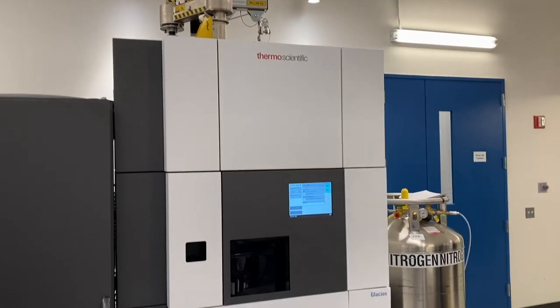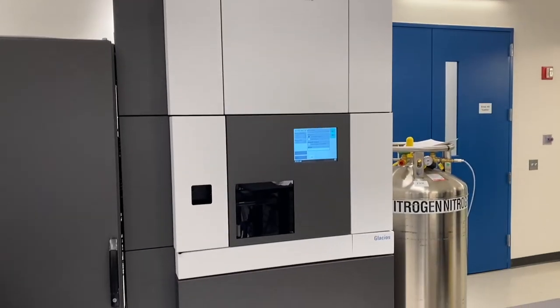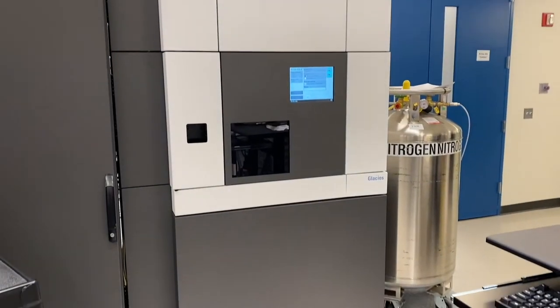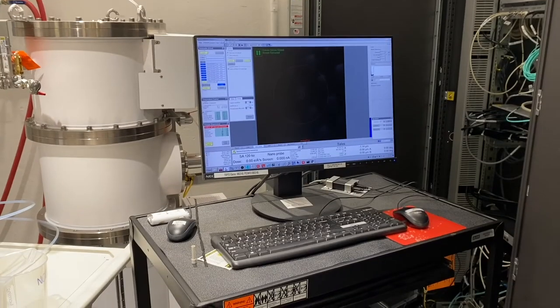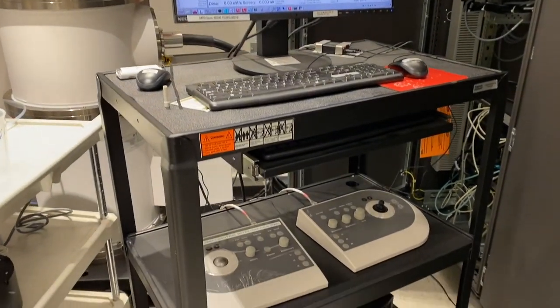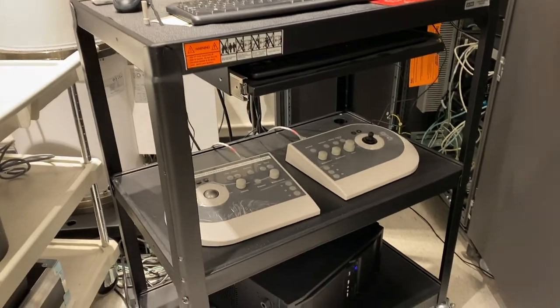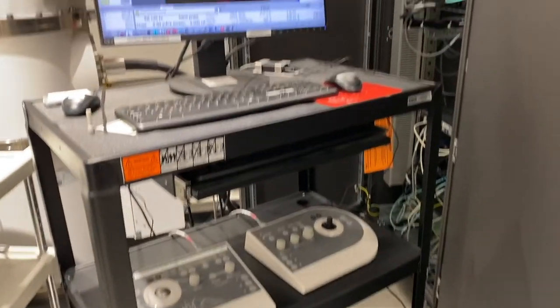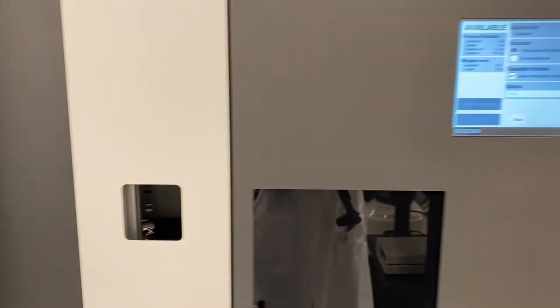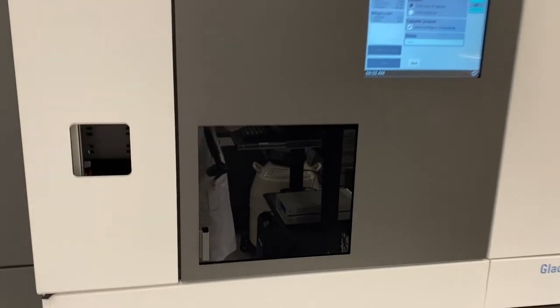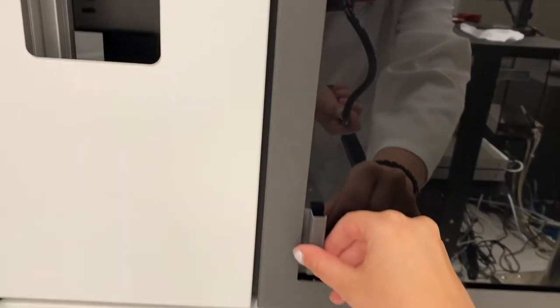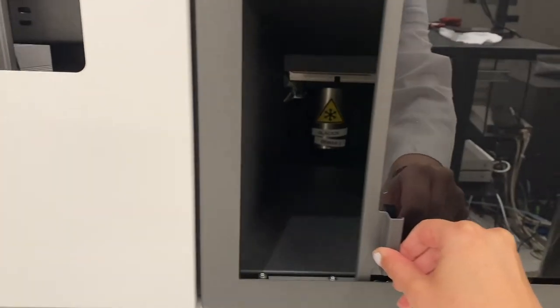This is a 200-kilovolt FEG screening microscope with an autoloader. This is our Microscope PC with hand panels. Over here is our loading interface, and behind this window is where we can load our grids.